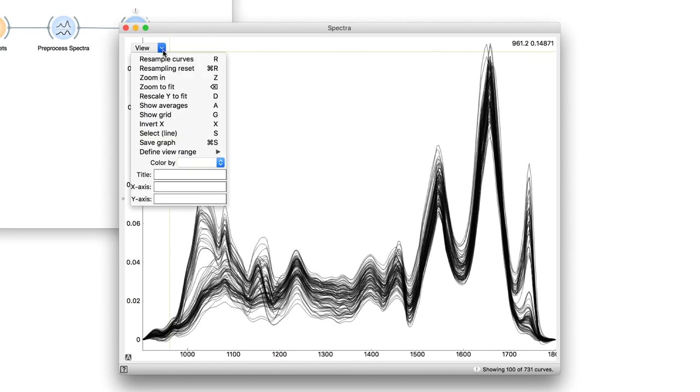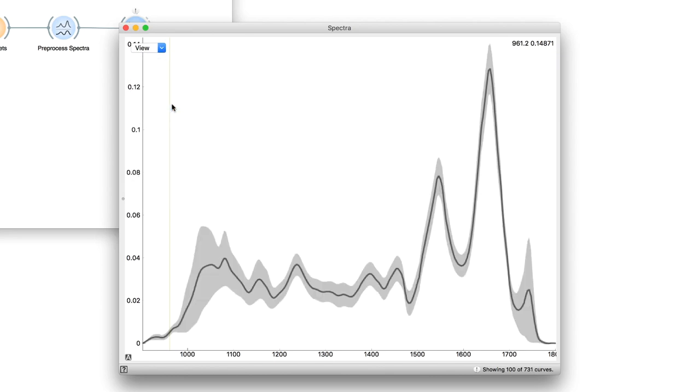Let's first select the average visualization from the menu. We see the mean spectrum of the whole dataset in thick black line and a shaded area that represents plus or minus one standard deviation.